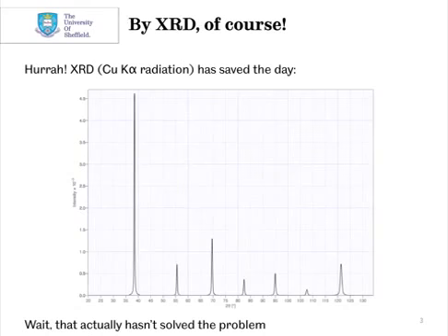Well, the one thing you can do, obviously, is do some XRD on it. So you get an X-ray diffraction pattern, and it looks like this, a very nice pattern. Looks almost like someone simulated it in CrystalDiffract. But that doesn't actually solve your problem. Now you have a shiny piece of metal and a diffraction pattern.